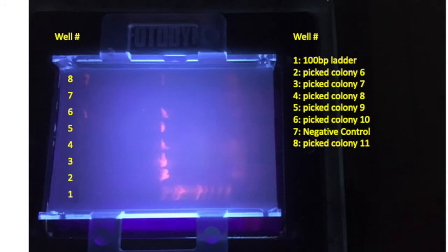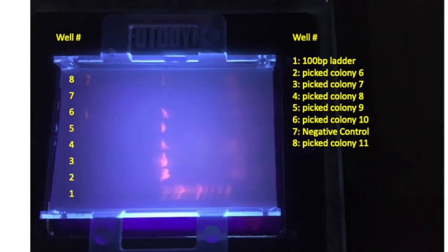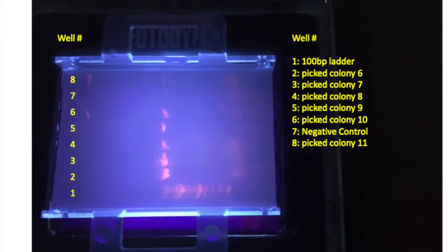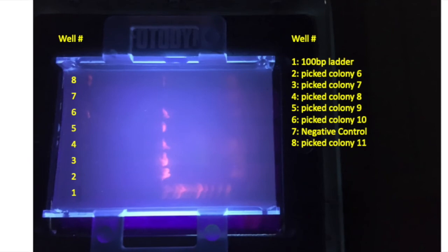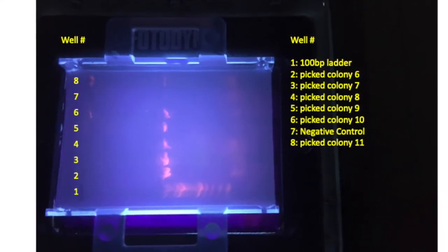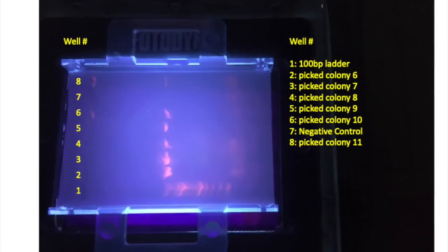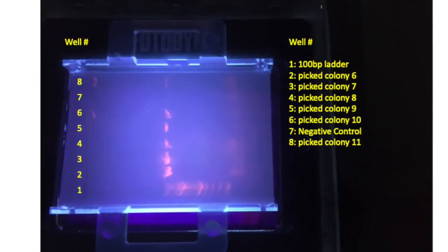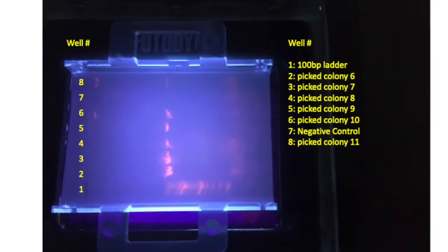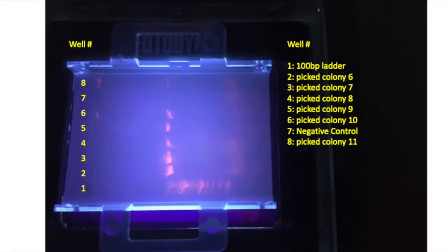In this other gel, not all the samples amplified as well as in that first gel. But even the sample that's shown in the far lane, in lane 8, even though it's faint, that amplification is sufficient for Sanger sequencing to be done successfully. If you're not sure, show your instructor the results of your electrophoresis.